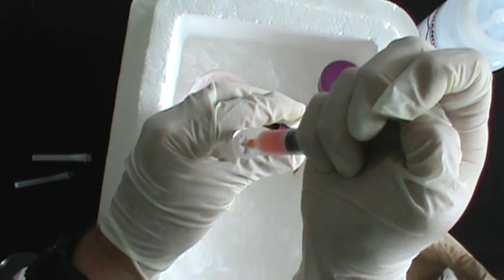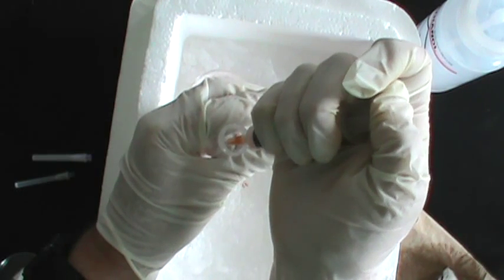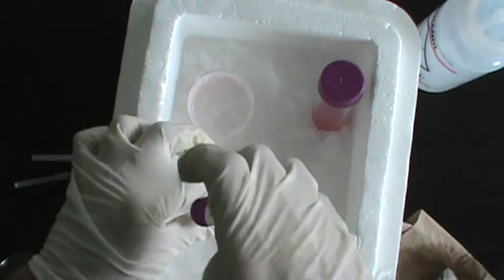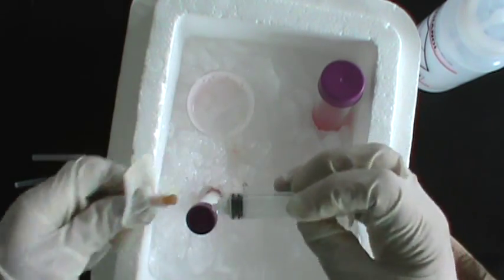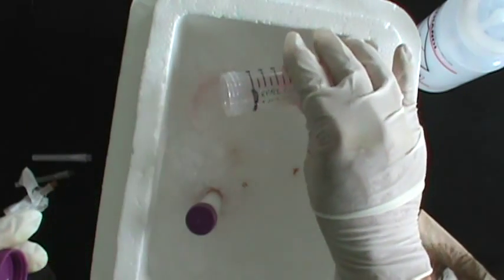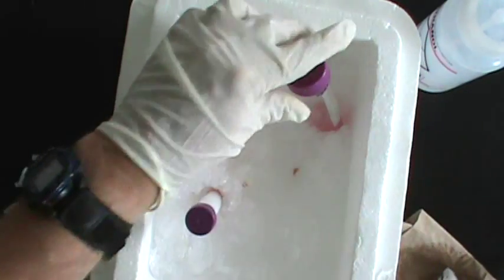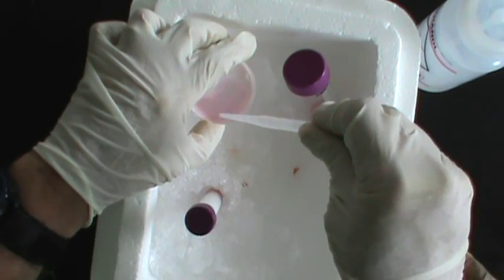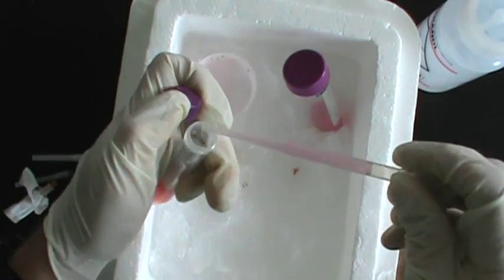Now we may still have quite a few cells remaining in the dish, so to make sure we don't leave those cells behind, put a small volume of culture medium into the dish and transfer it into the 15 mil tube as well.